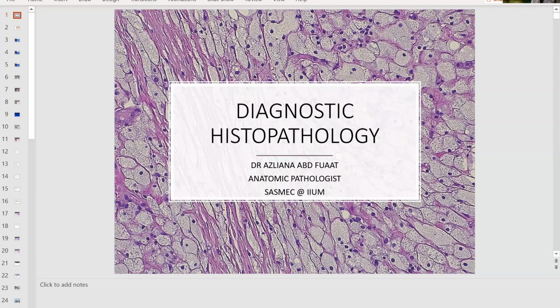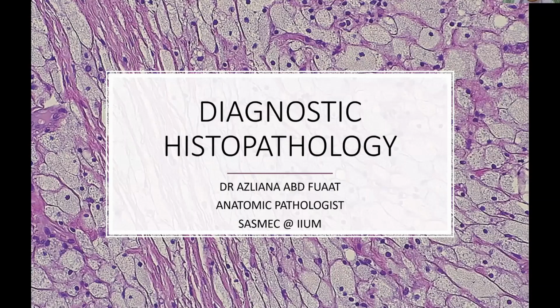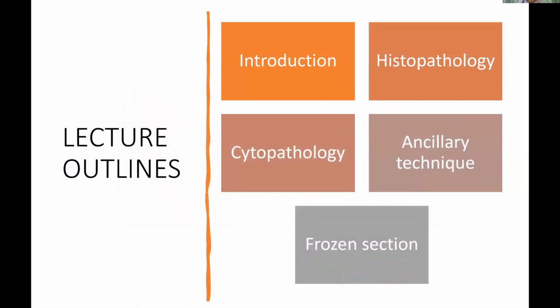All right. Diagnostic histopathology. Basically, this is what we need to learn from this topic: introductions, then we need to cover the components in histopathology, cytopathology, the ancillary techniques that we have, and the last one, frozen sections.